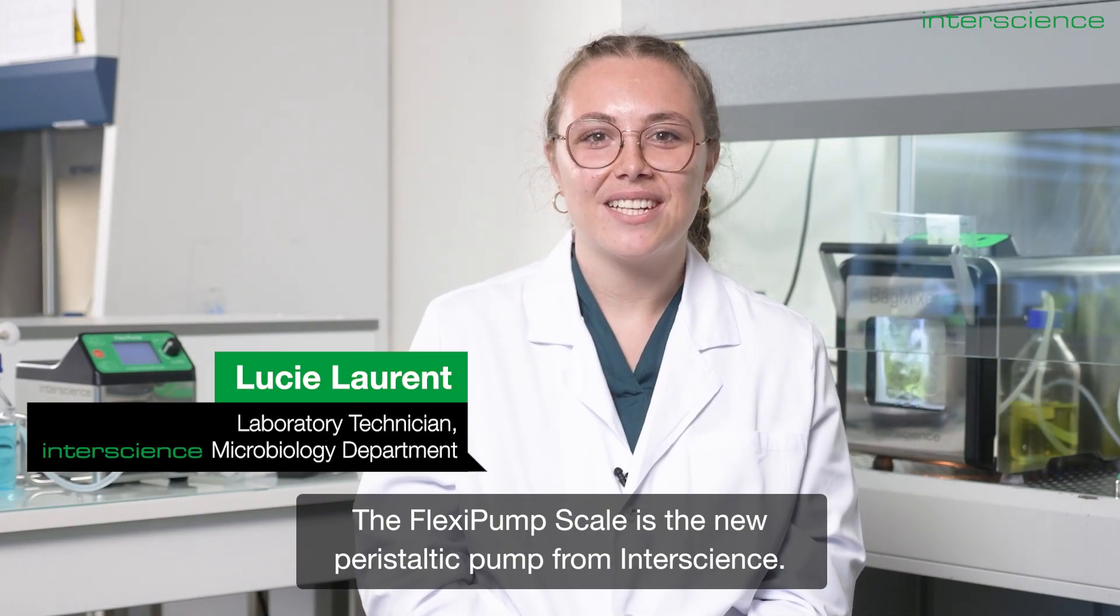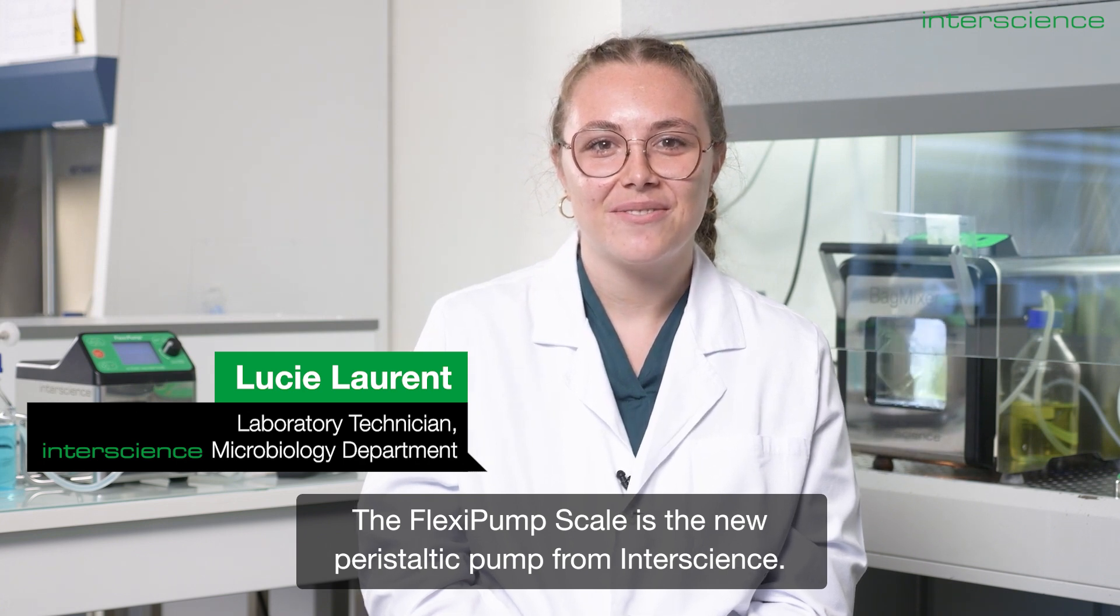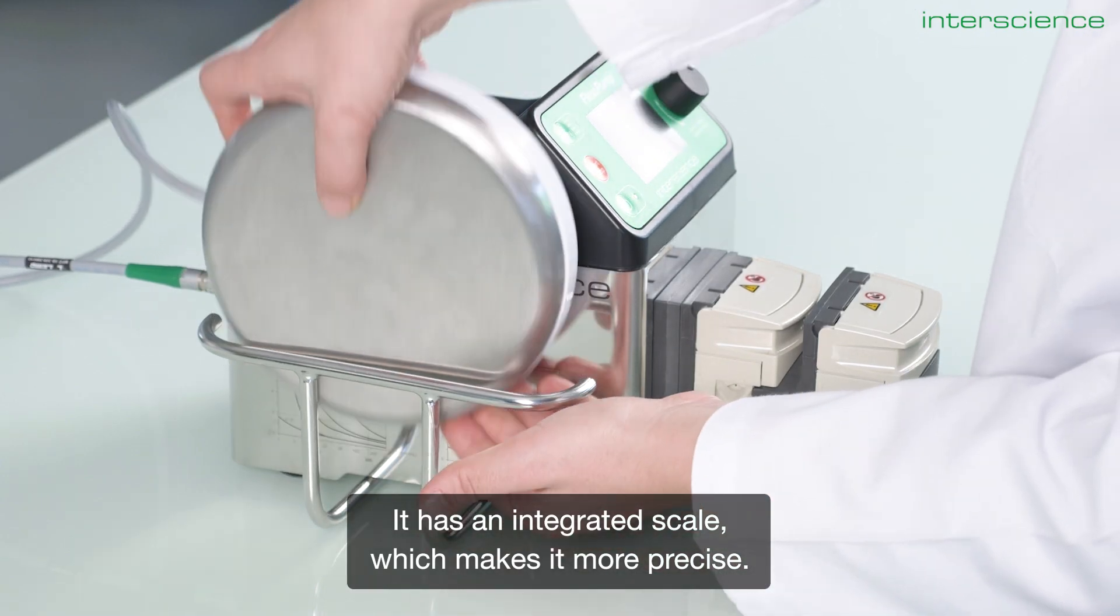The FlexiPump scale is the new peristaltic pump from InterScience. It has an integrated scale which makes it more precise.